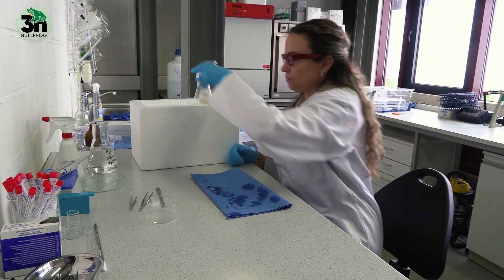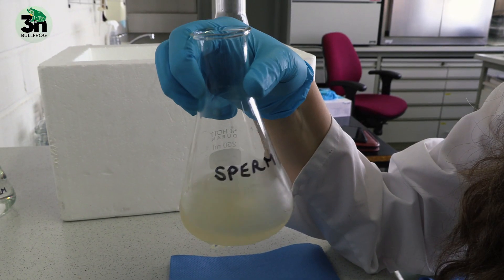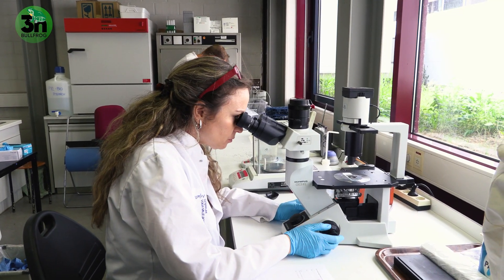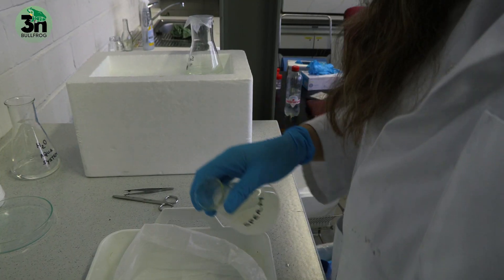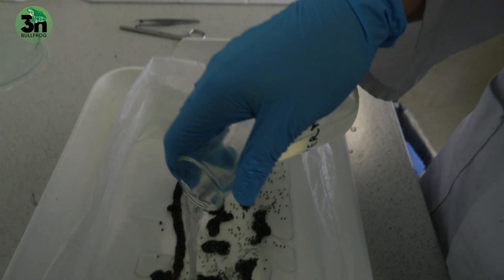Once we retrieved the eggs from the female, we stimulate the solution of spermatozoids that we have with the simplified amphibian ringer solution with some water at a temperature of 22 degrees. That induces the motility of the sperm. Then we put the sperm on the eggs and the fertilization process starts.